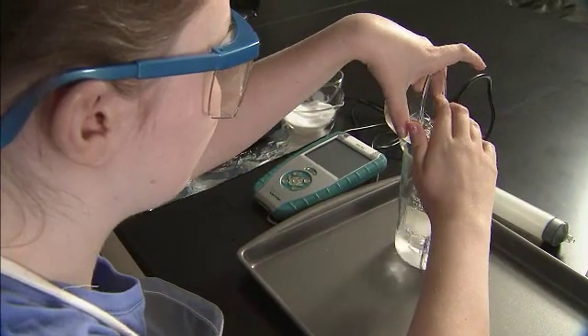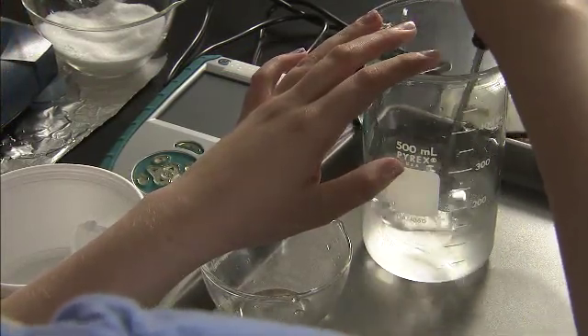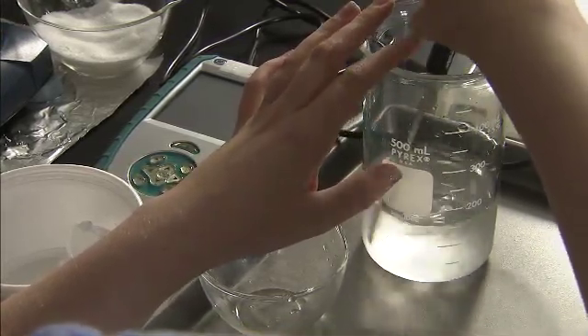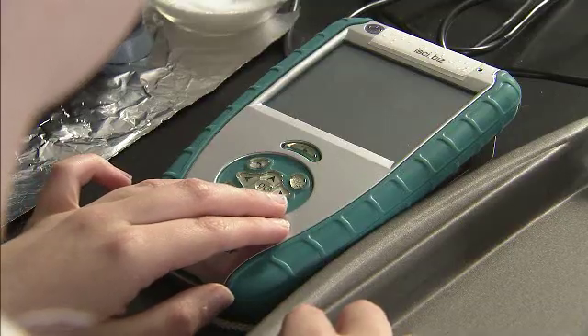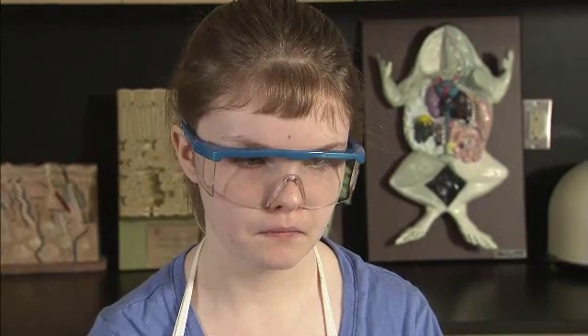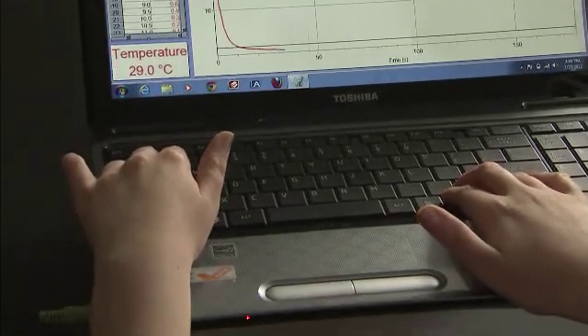She then begins to add ice to the solution and uses the temperature sensor to stir it. She continues this procedure until the temperature stabilizes, at which point she ends data collection on the Talking LabQuest. As you may have expected, this temperature is below the normal freezing point of water due to the presence of the salt. The data has now been recorded into a data table on the Talking LabQuest for Aaliyah to review. To analyze the data, it should be imported to the Logger Pro software on a computer using a mini USB cable. A WindowEyes app has been developed to provide accessibility to the Logger Pro software.